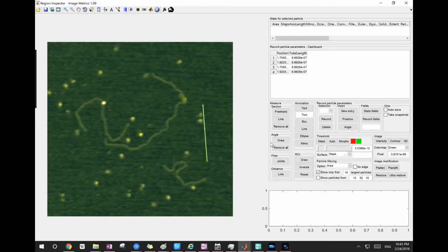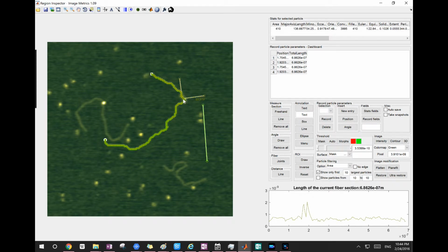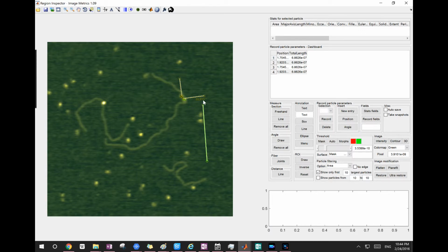So in this case, I just click band and draw angle, and then I have a crosshair cursor, and then you can trace the DNA that's coming out of the protein. And after you've done that, you can adjust the arms either way. And again, you can see that you have this band angle label there. You can adjust its appearance using the text, and I've discussed that before.